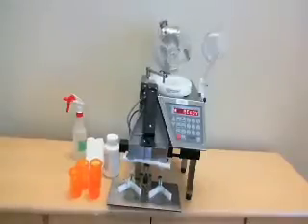This is a demonstration video of the Kirby KL50icf bottling and QC device. We're going to be showing the basic operation as well as cleaning of the device.